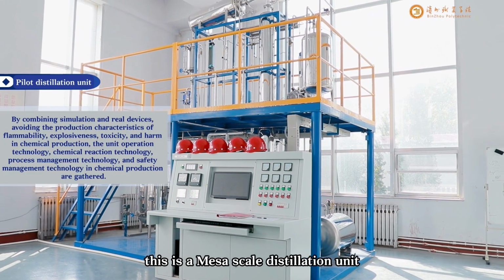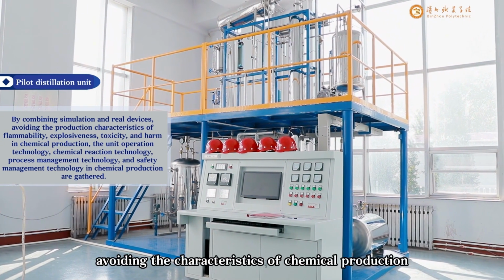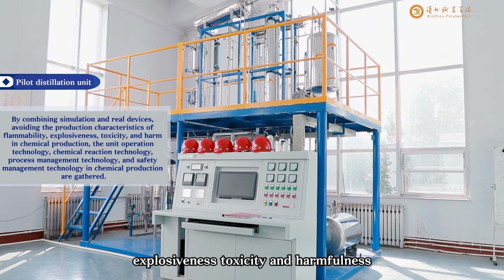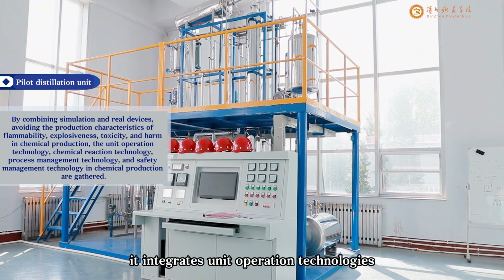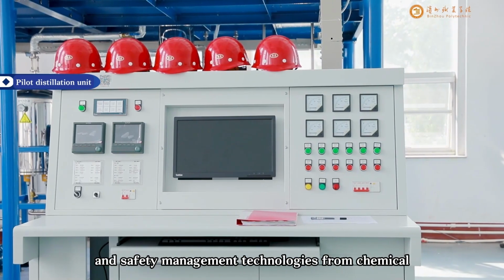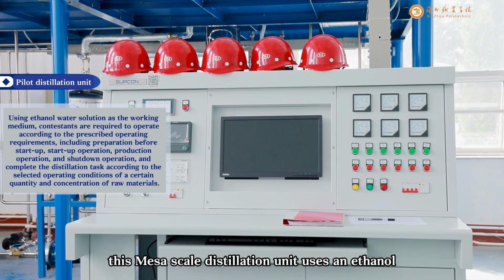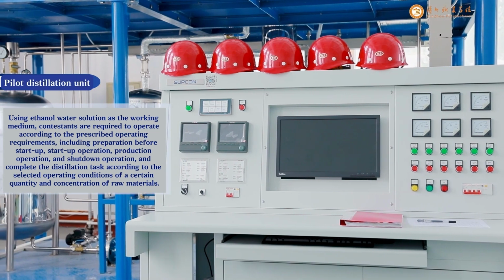This is a mesoscale distillation unit. It combines simulation and real equipment, avoiding the characteristics of chemical production such as flammability, explosiveness, toxicity, and harmfulness. It integrates unit operation technologies, chemical reaction technologies, process management technologies, and safety management technologies from chemical production. This mesoscale distillation unit uses an ethanol water solution as the working medium.